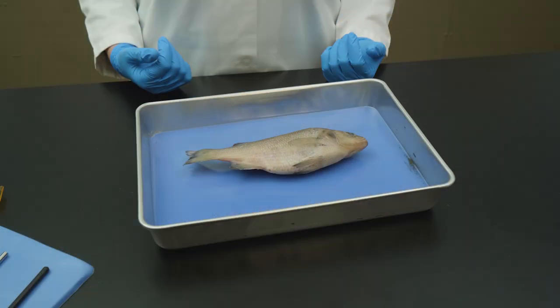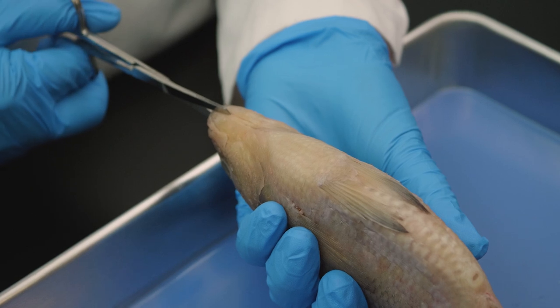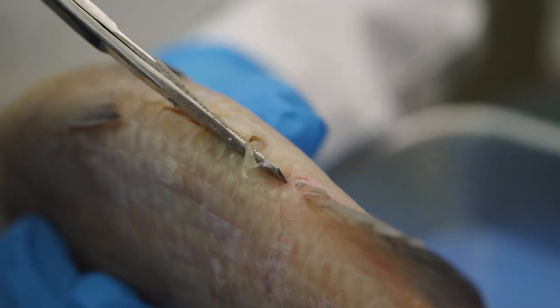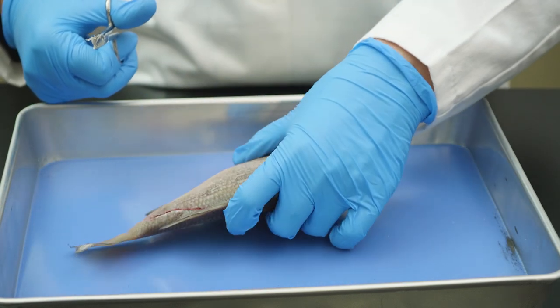Now, let's examine the internal anatomy of the perch. To see the internal anatomy of the perch, we must remove the skin, muscles, and bones from one of the lateral sides. Using the sharp scissors, we begin at the opening of the mouth and make a lateral incision along the ventral side of the fish between the pelvic fins and down to the anal fin. We need to keep the cut as shallow as possible to avoid damaging the internal organs.